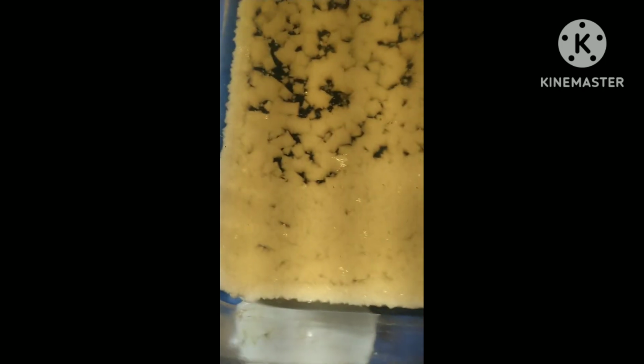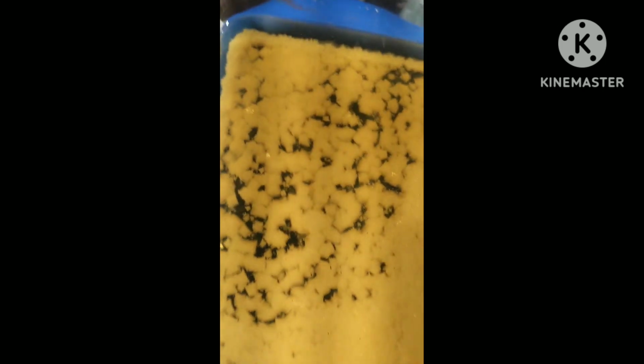The solution's still yellow, but the crystals will be nice and white from under this solution when they're all done growing. And as you can see, it's growing some nice chunky crystals that are big squares, basically. Really neat looking.